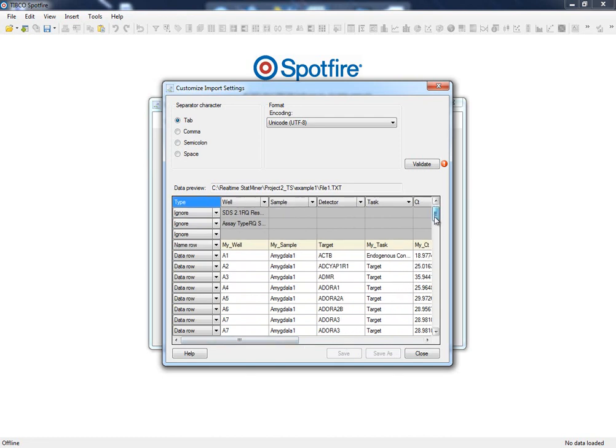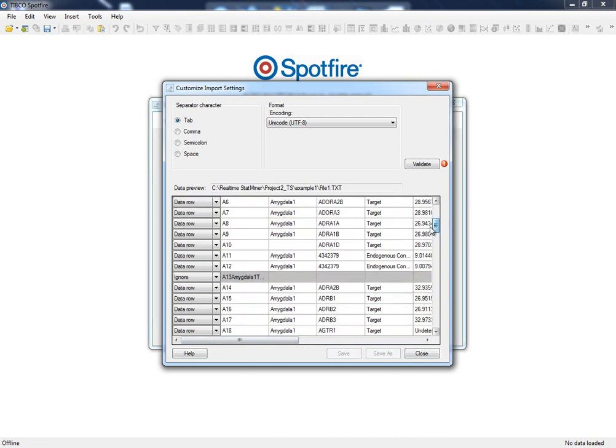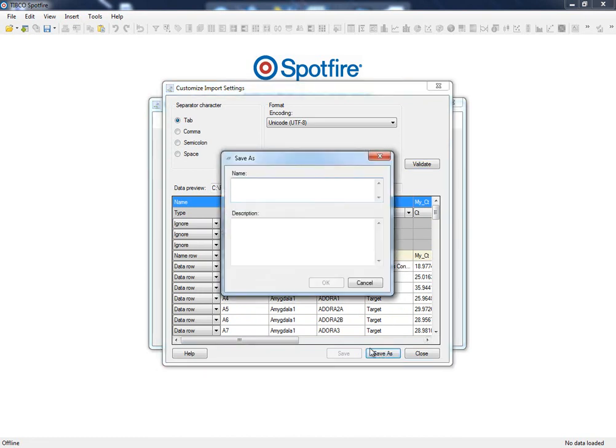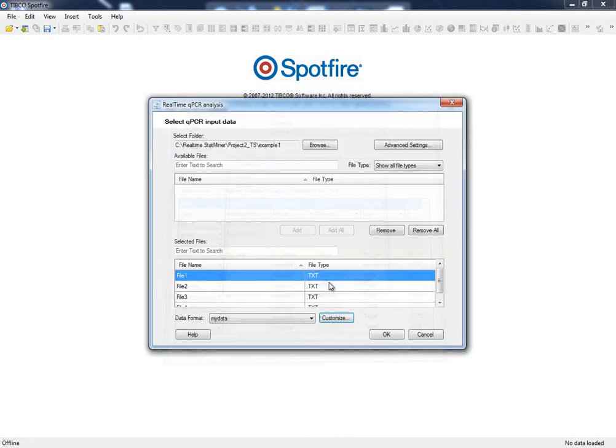It is important to know that those entries with the missing sample or detector name will be automatically ignored. We are finished and are going to save these settings into a template that we can use later for future analysis.